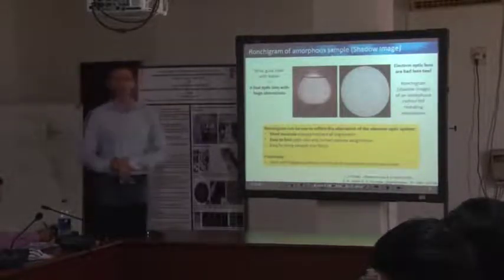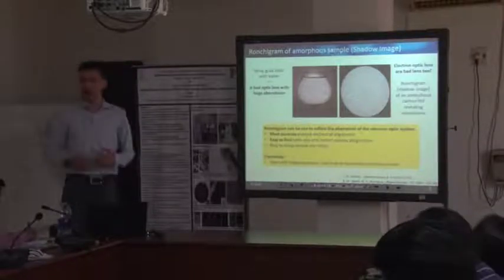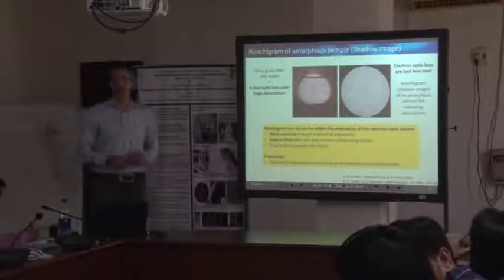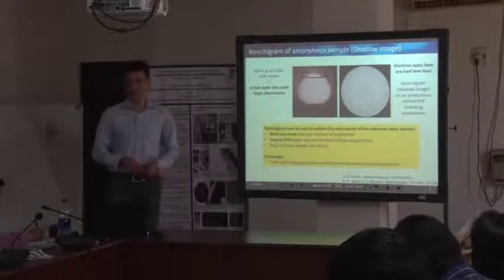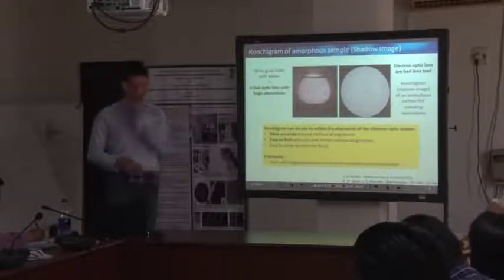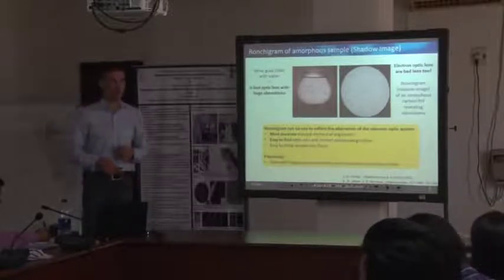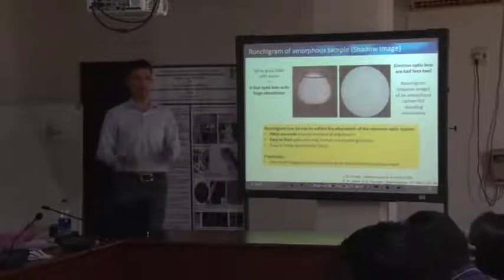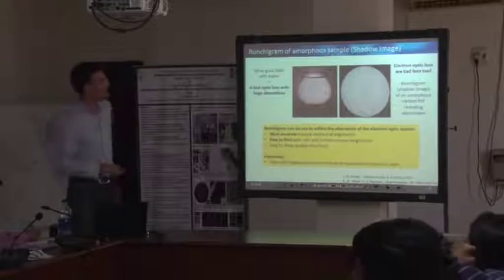So let's have a look at what we see in our microscope, just to do some alignment in STEM mode. Some of you already attended the lab course yesterday, and we did some STEM imaging of our aluminum sample already. We even tried atomic resolution imaging, but unfortunately the sample turned out to be a little bit contaminated.